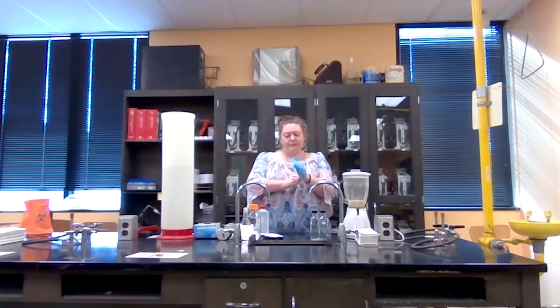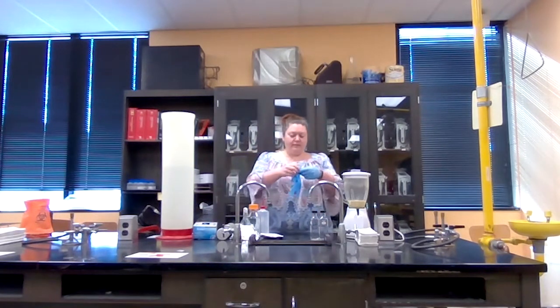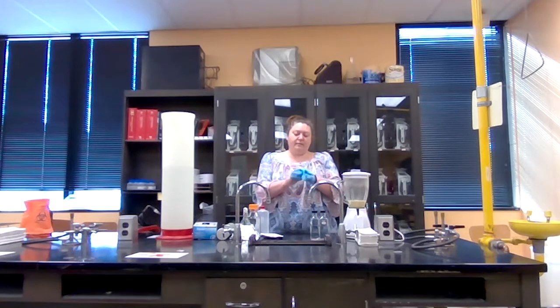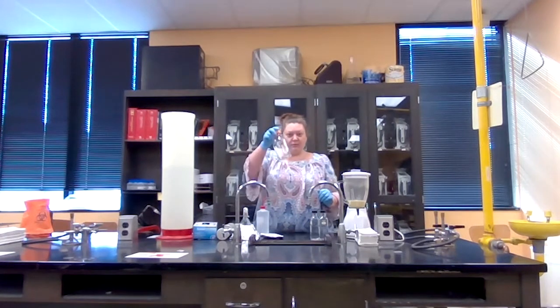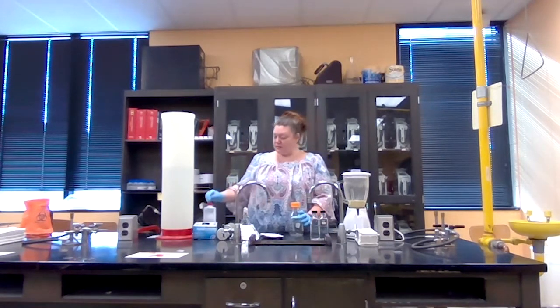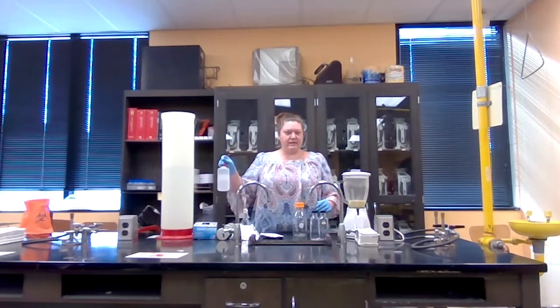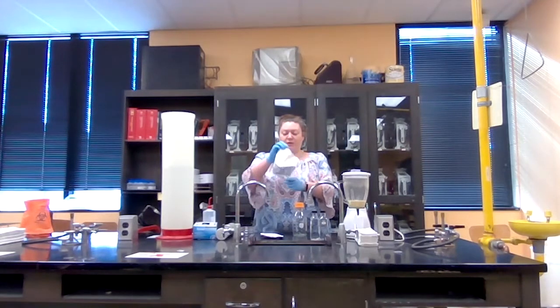So I'm going to grab some gloves. There we go. All right, so I have my bottle that I'm going to strain things into. And again, everything has been sterilized. This is in case I accidentally touch something that I shouldn't, to help sterilize or disinfect it. All right, so here is my funnel, and it's been sterilized. So it's all wrapped in foil.